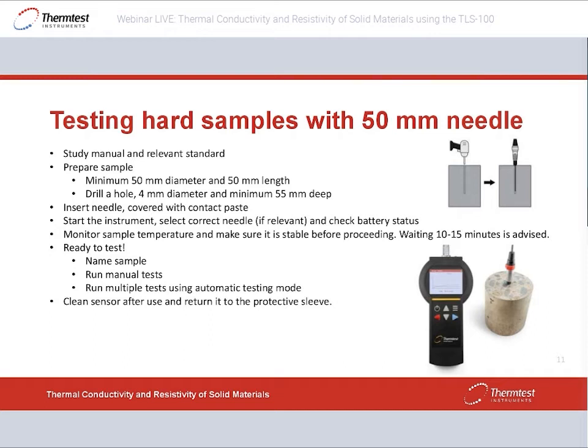You name your sample, and then you can run a manual test just by pushing the blue button you see here on the picture. Or you can set it up to do multiple tests in an automatic mode. That's a nice way to get some statistics, and the machine will take care of that while you do other work, for instance. Once you're done, pull out the sensor, clean it, and return it to its protective sleeve and place it in the case, of course, to avoid any damage. You also don't want to leave the paste on the needle, since it dries up and you might have issues getting rid of it later on.